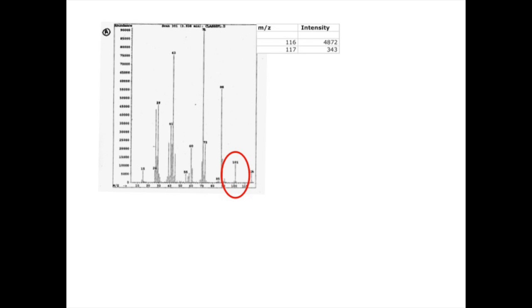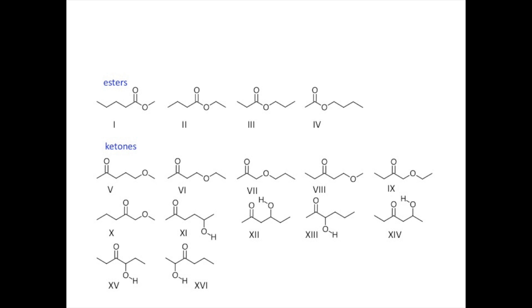Recall that this molecule should exhibit the loss of a methyl radical. Let's see how this might happen with a few of these structures. Let's consider structure 2. If we ionize at the saturated oxygen, then alpha cleavage leads to the loss of a neutral methyl group. Most of the candidates that I've drawn here can lose a methyl group. In order to save time, I did not bother drawing structures that would not cleave off a neutral methyl group.